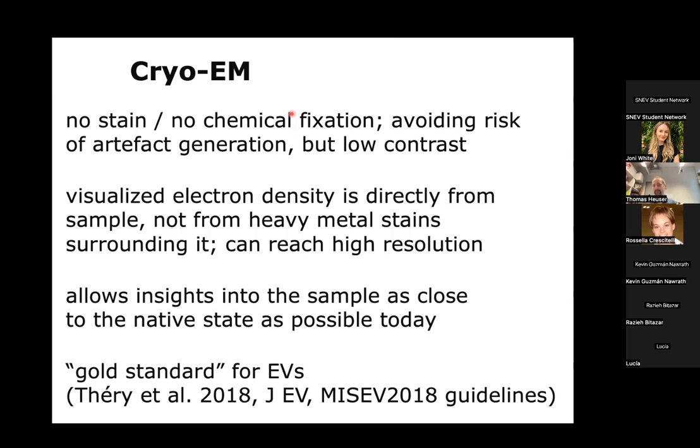And this gives us the high resolution power that we need, for example, to visualize also the double membrane of EVs. And this is considered, as of today, the technique you can use to visualize your samples as close to the native state as possible. And therefore, this has also been identified, for example, in the Journal of Extracellular Vesicles as the gold standard for visualizing EVs.